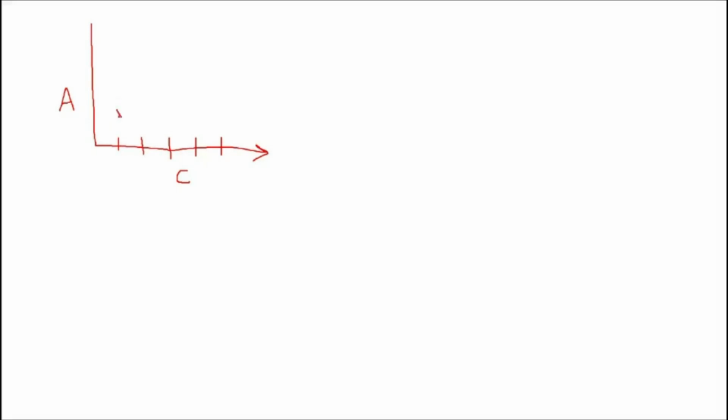Suppose this is absorbance value for 2, then this is absorbance value for 4, this is absorbance value for 6, then this is for 8, and this one is for 10. Now, if you will observe these outcomes closely, they do not fall on a straight line. Okay, they are on the either side of the straight line. Okay, so I can say that approximately linear relation exists between concentration and absorbance by looking at visually.